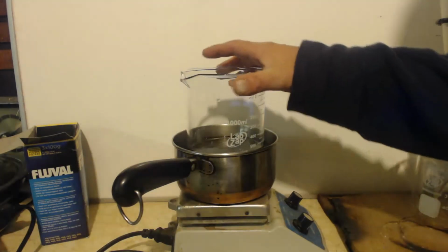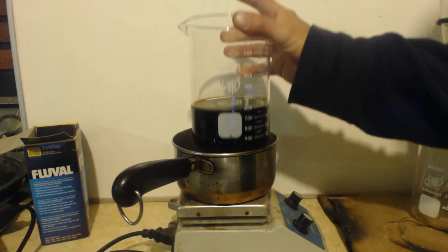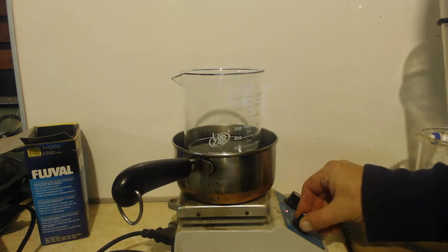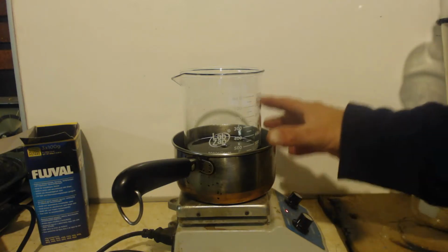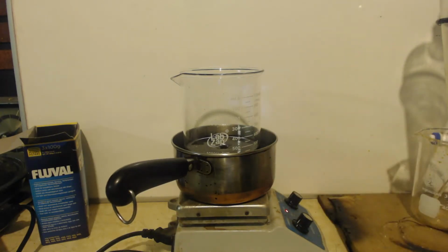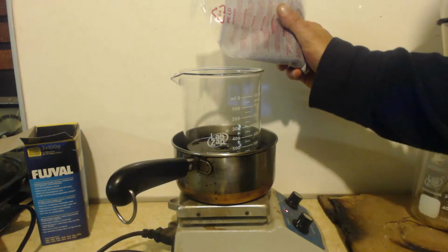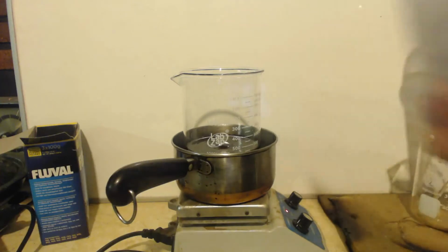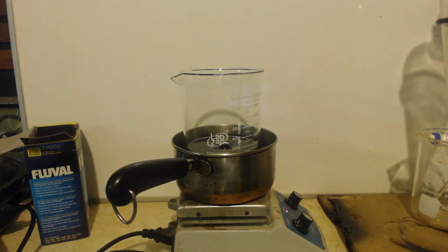Well, I washed it twice with DCM, like I said. Try to get the xylene out. I'm putting it in this, and this has hot water in it, because my heater doesn't work, but the stir rod does. So I'm putting this stirrer on, and I'll let it kind of be on this little hot bath for like an hour or so. And I got some activated carbon. I'm going to throw a little bit in, maybe like a gram or two. And we're going to let that heat up and stir for an hour. And then I'll get back with you.